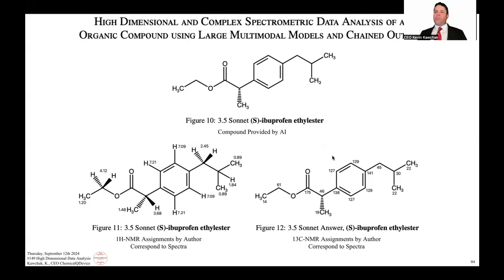Now, the ones that were trickier were these assignments. I already had the structure, and it was just to further prove it. And basically, I had these flipped, and sometimes you can get that with carbon. But it was the only way I could fulfill, with these assignments, the difference between the GHMBC and GHMQC, to fulfill both of those, where one was shorter range in bonds and one was larger. We see the CH2 and this methine. So again, across all these spectra, there were a couple of things with this isopropyl basically having interactions with many different parts of the molecule.